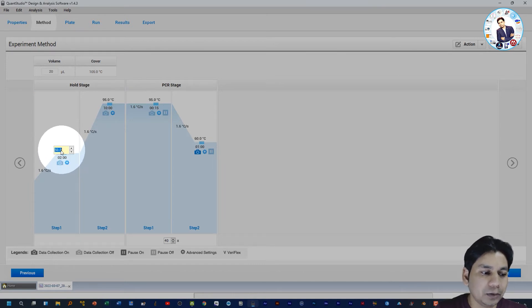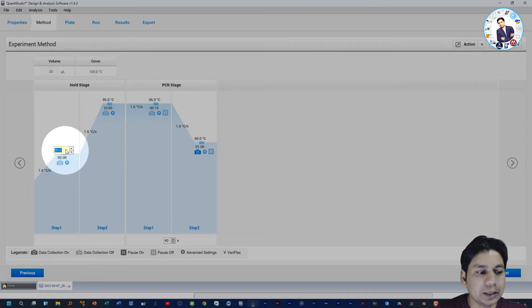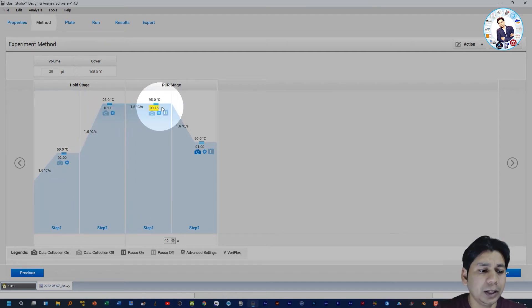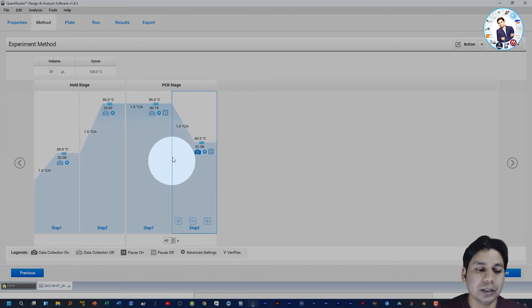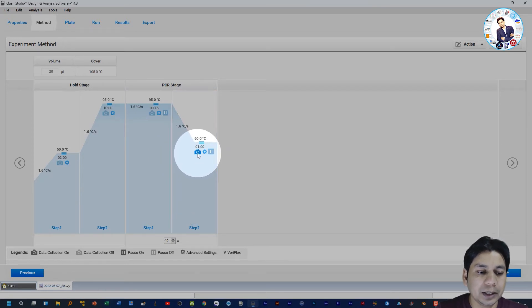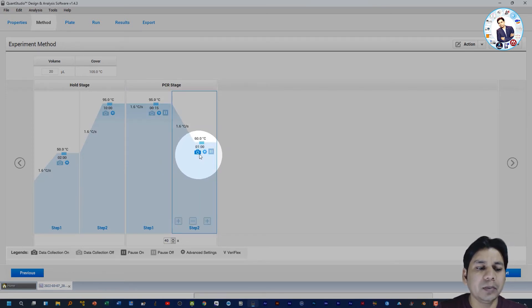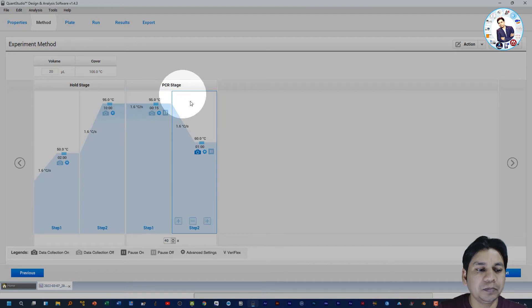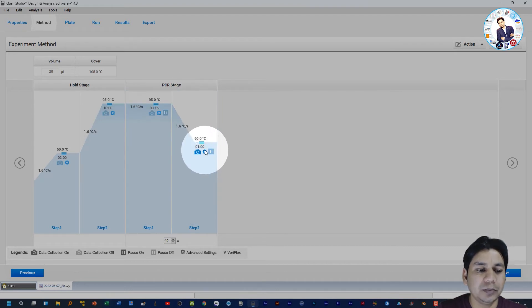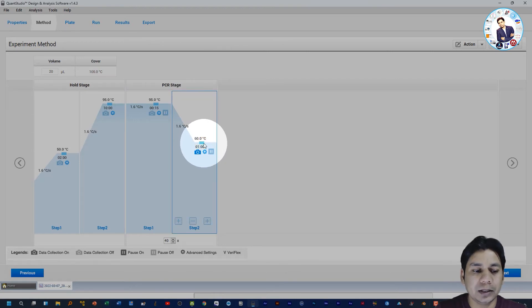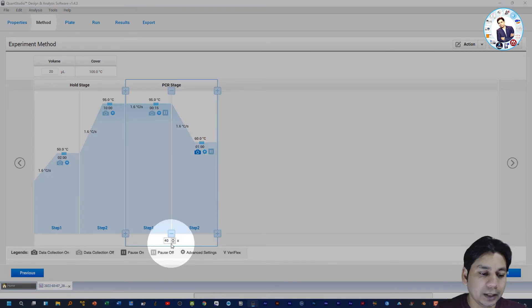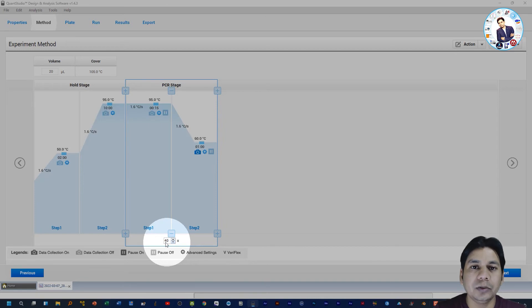To change values in the Hold Stage and PCR Stage, you can adjust them according to your choice. For example, click on the temperature value to change it, and you can also change the time at every stage. Here you can see the camera icon is highlighted, meaning data will be recorded at this annealing stage. Note that in most real-time PCR experiment setups, the annealing and extension steps are merged together.